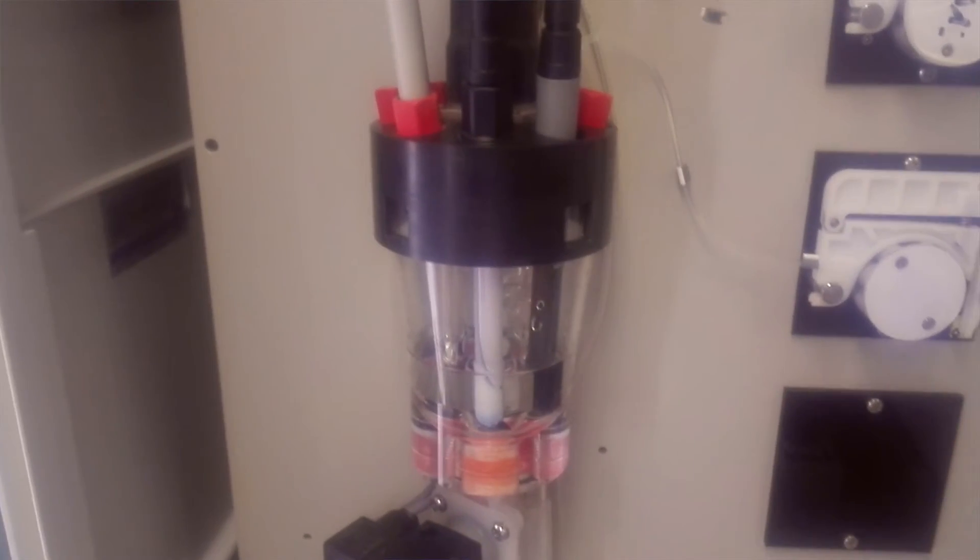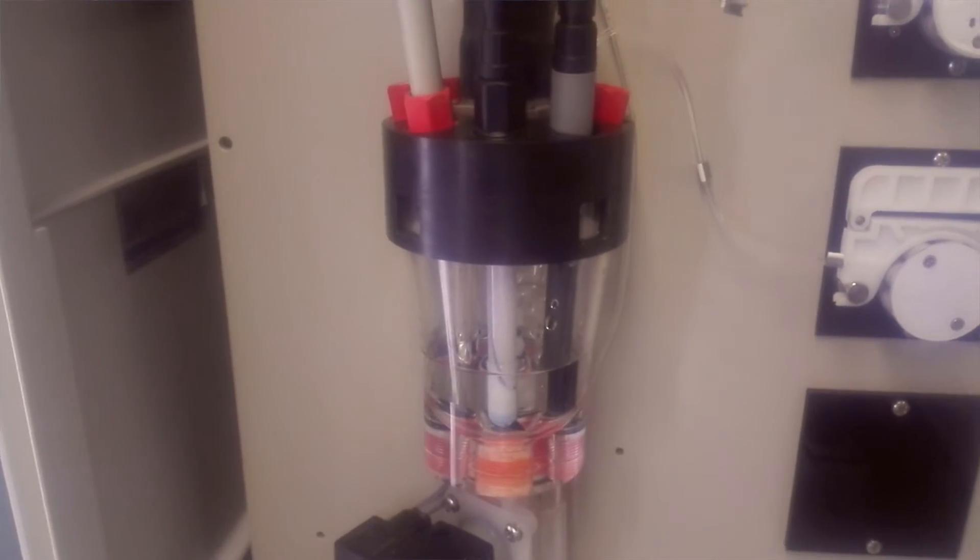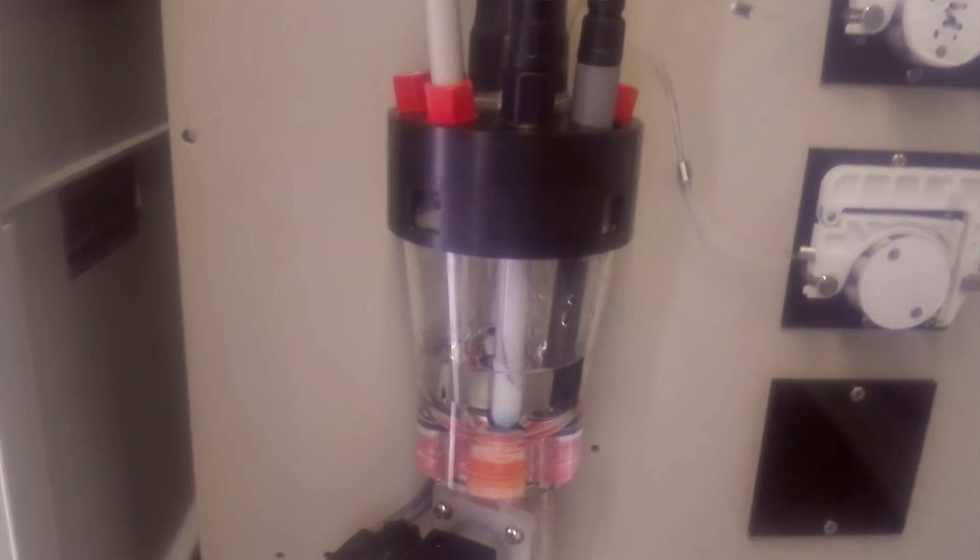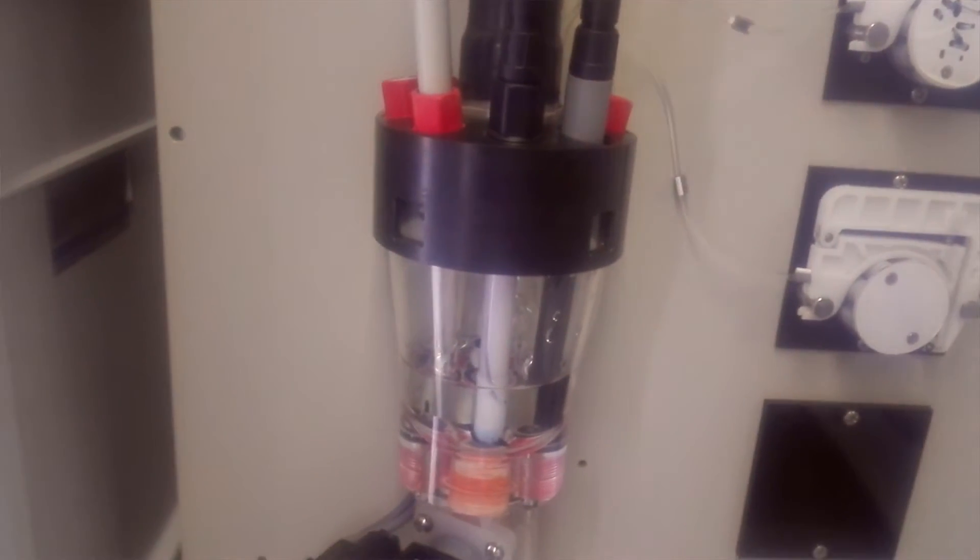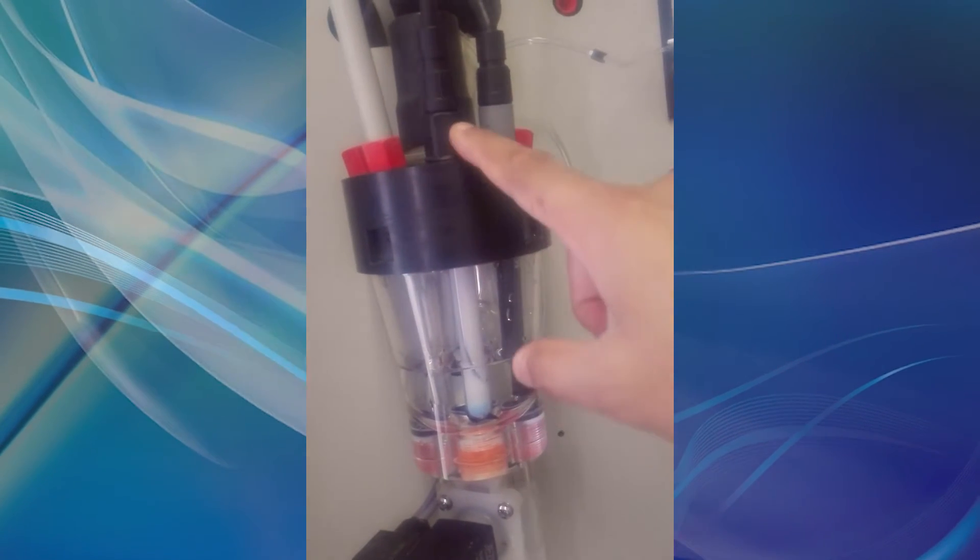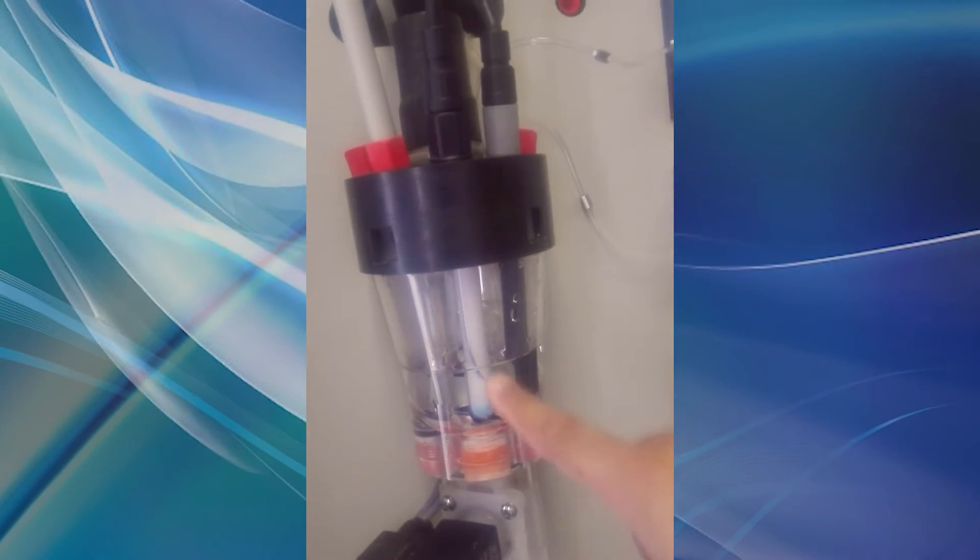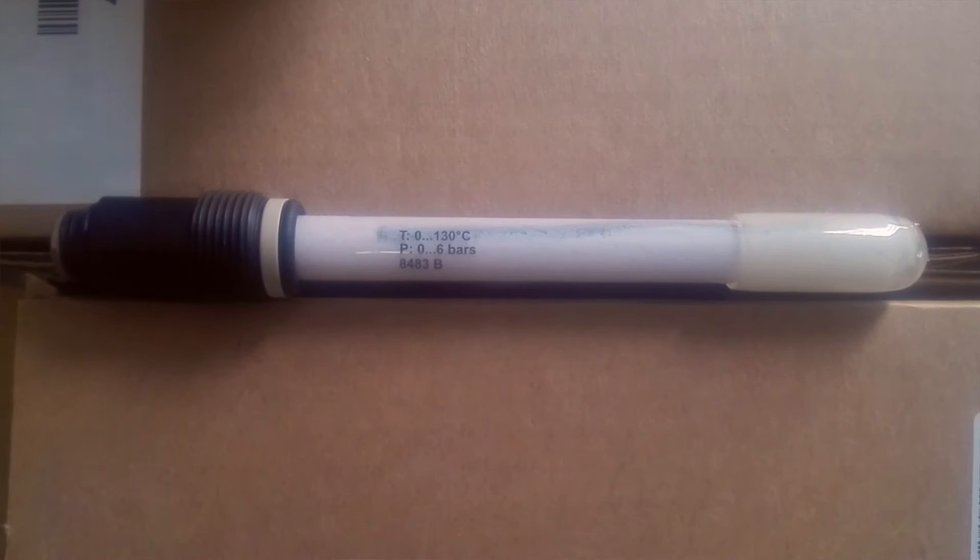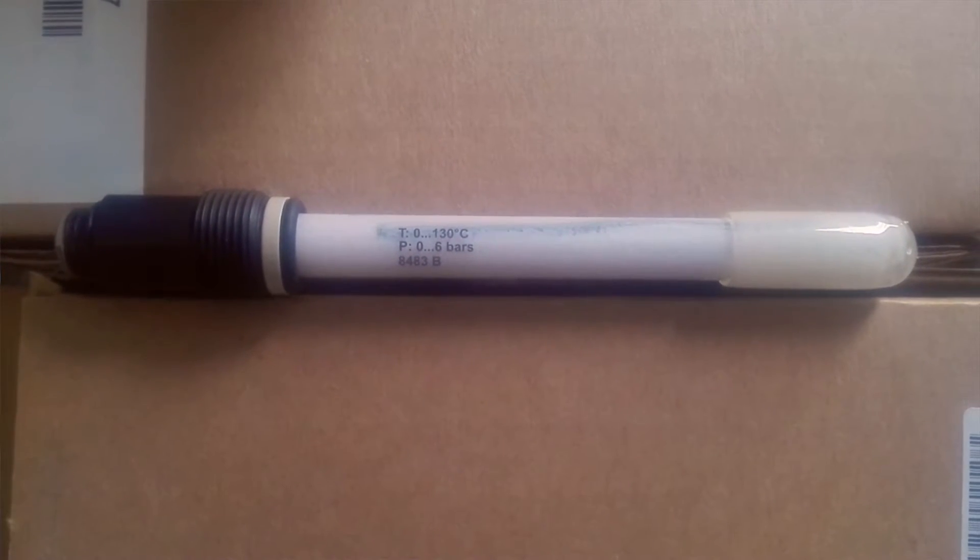In potable water, we usually dose chlorine. If we use an ORP electrode, it is so sensitive to chlorine and shows very high readings when it detects chlorine, so you cannot do titration with an ORP reference electrode. To avoid this issue, we use a pH reference electrode. In this case, we use the millivolt value of the pH reference electrode. We don't care about the pH reading; for us, only the millivolt reading is required to do our titration.